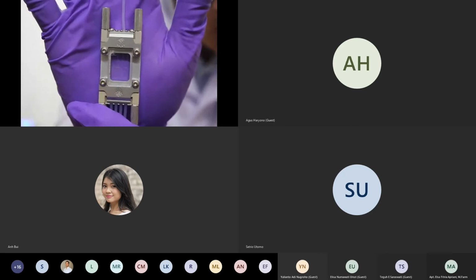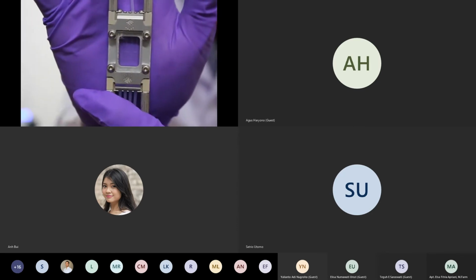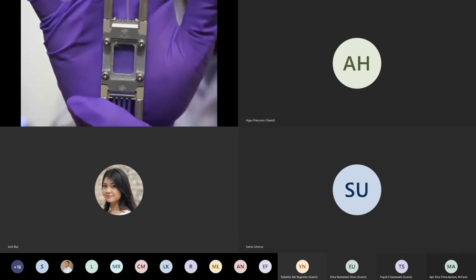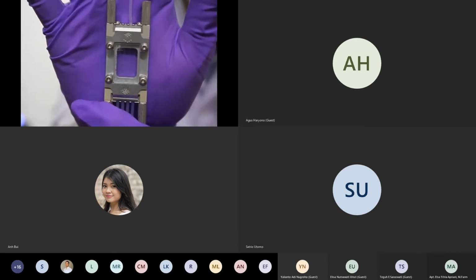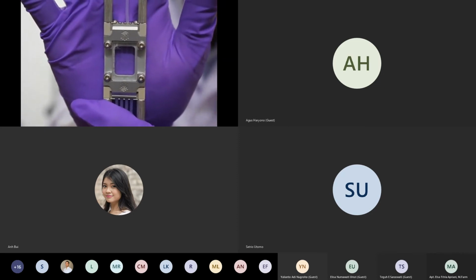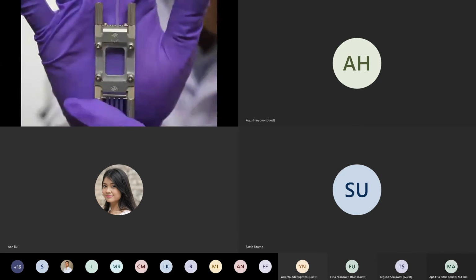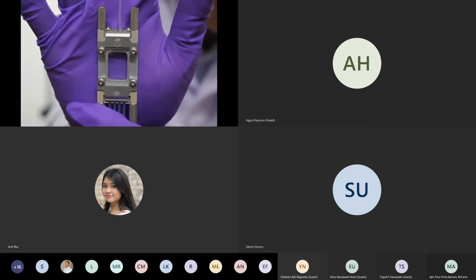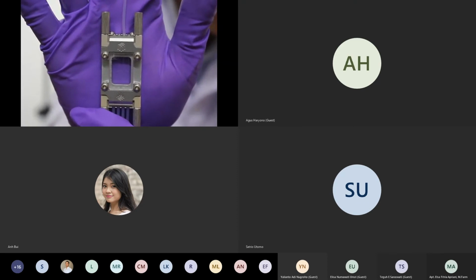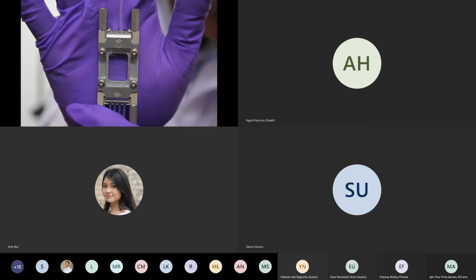It's our chip with the 8 interface connector and linear connector, so it will connect with the tubing. It's a droplet junction chip with 100 micrometer size. You can see in here, the channel of the chip is 300 micrometer, and the chip junction is 100 micrometer.